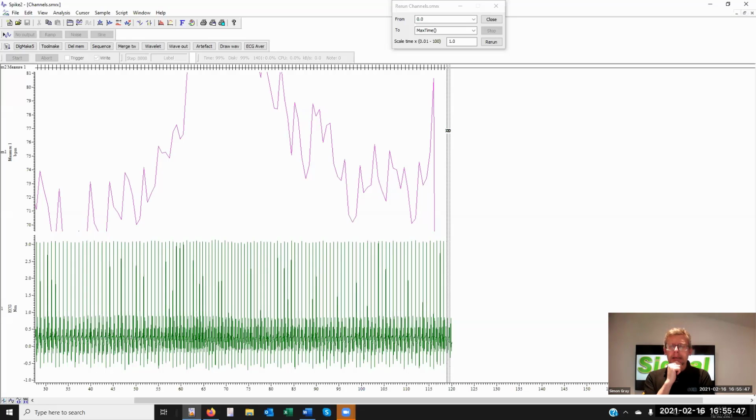Hours and hours he spent, and I met him one day, and I put together a script which was probably only 5 or 6 lines, and it went through his sleep recording of 8 or so hours in a few seconds, and dumped the data out, and that was it. And he sat there banging his head on the table. So if he'd accessed the scripting language, perhaps he could have saved himself a lot of time.